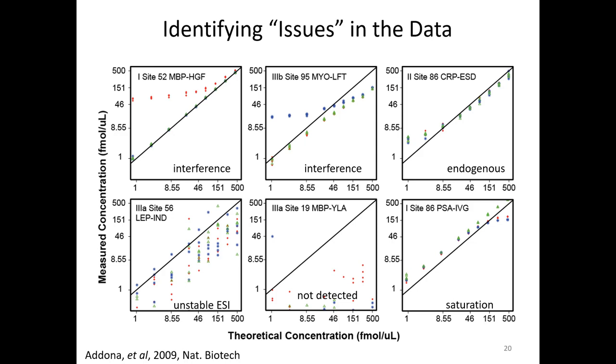This one is just a hot mess. There's a very terrible linearity to this, and the scatter is crazy. What happened here is that the electrospray from the nanotip was unstable. And so we were only getting about 4 points across the chromatographic peak, and the signal was very jittery. So this is a physical condition that leads to a math-based issue, which is calculating reproducible peak areas.